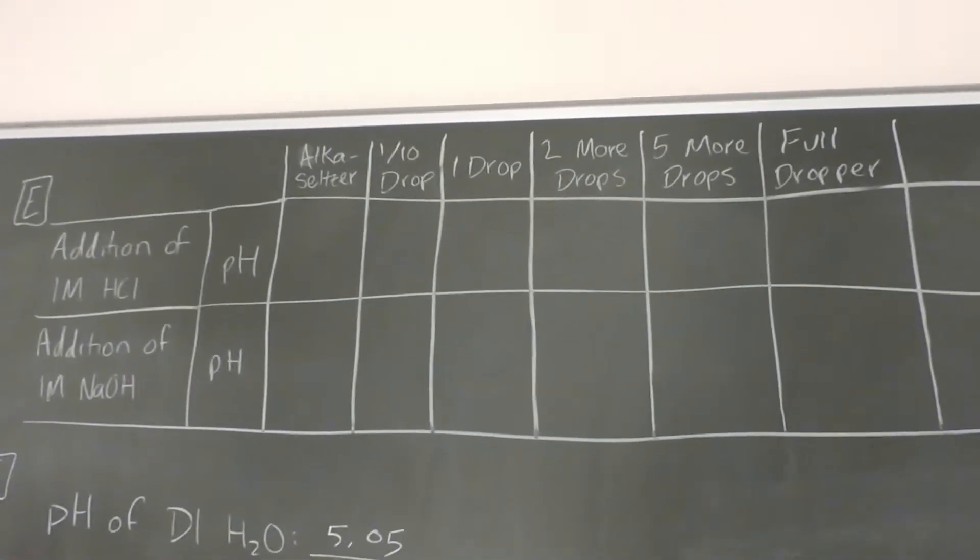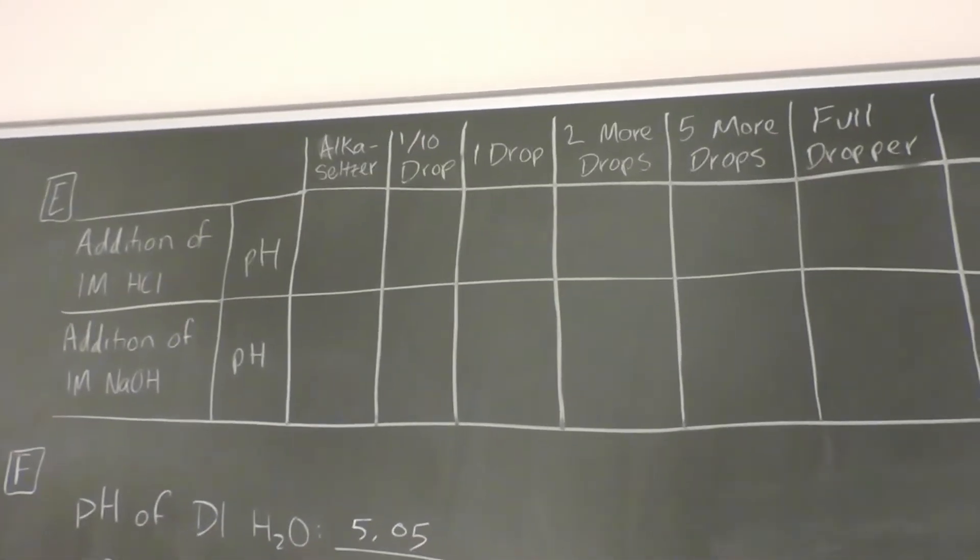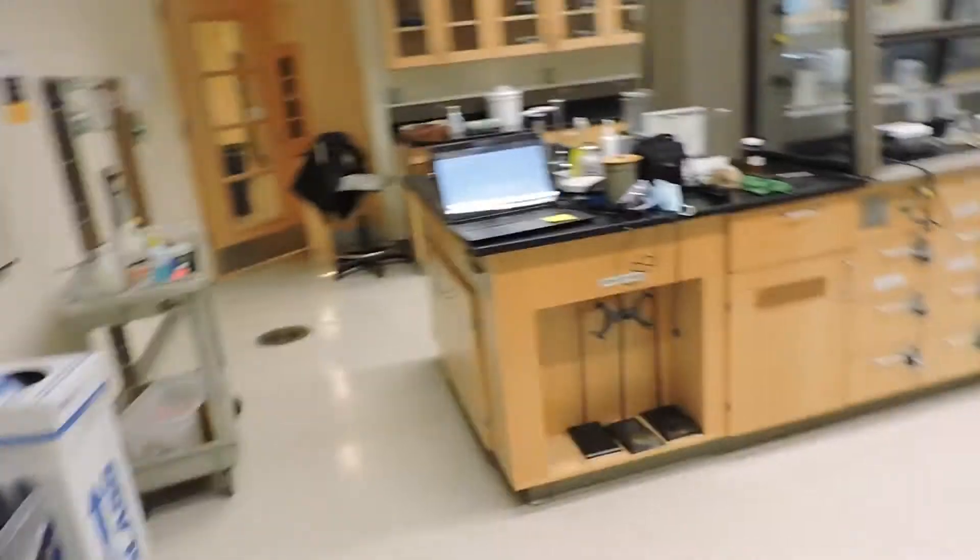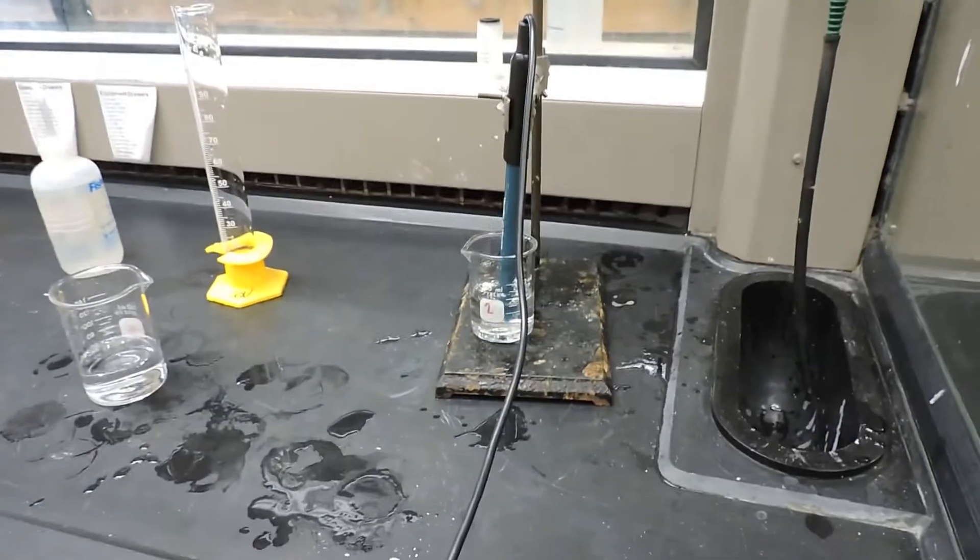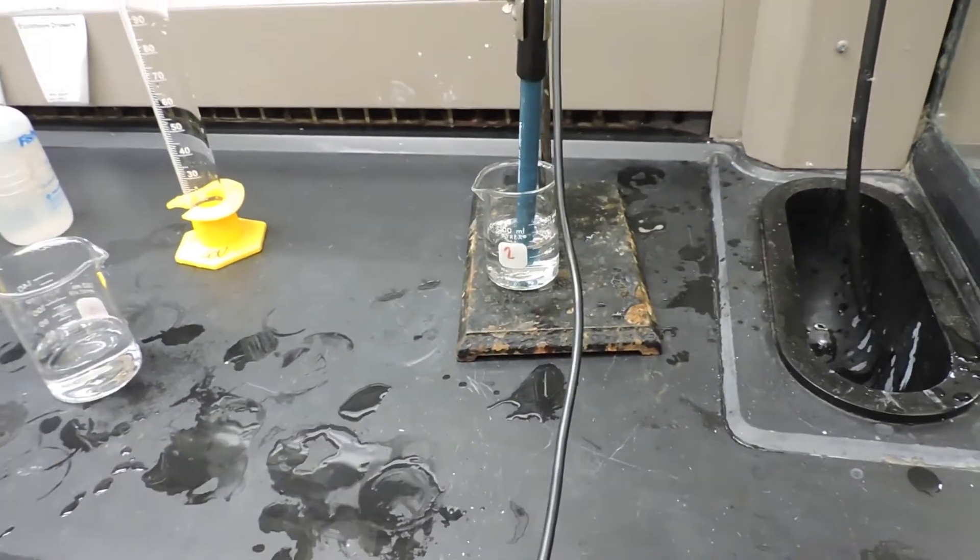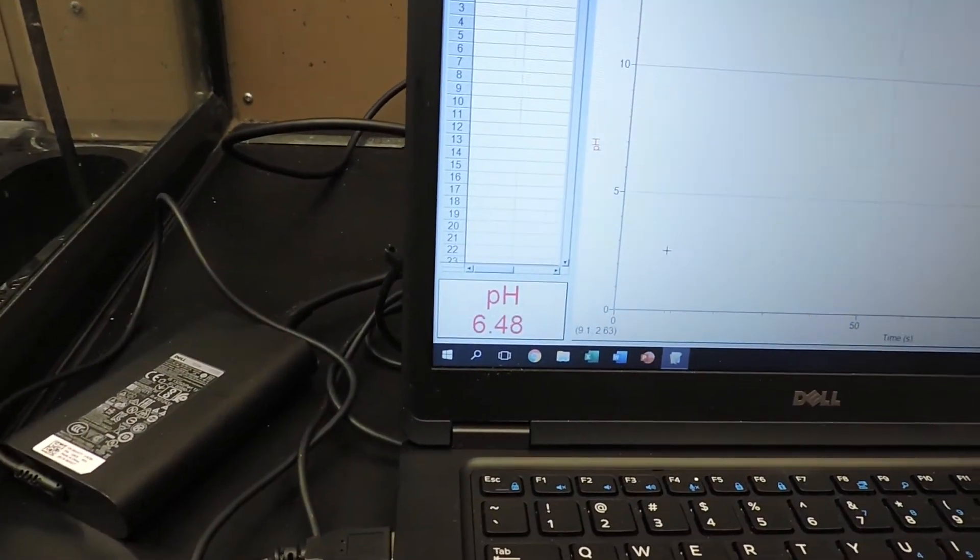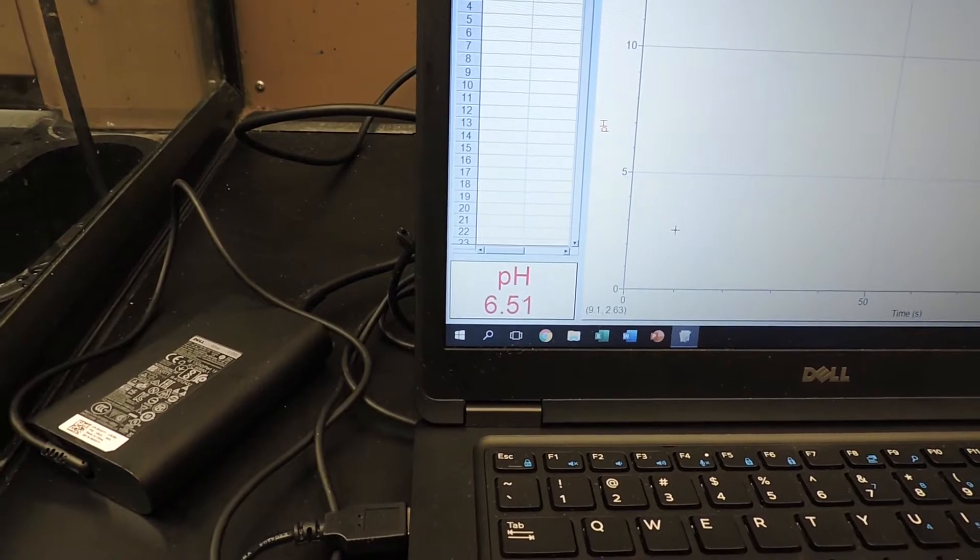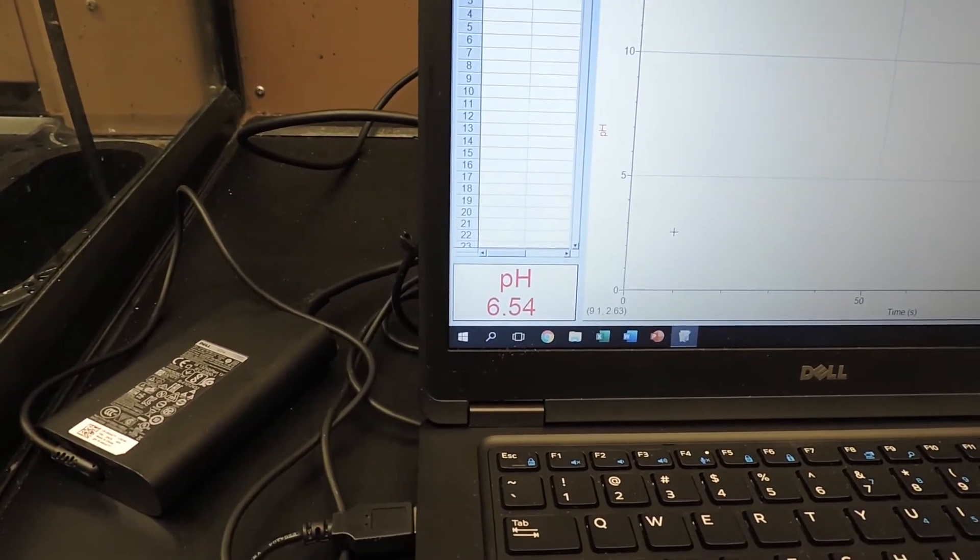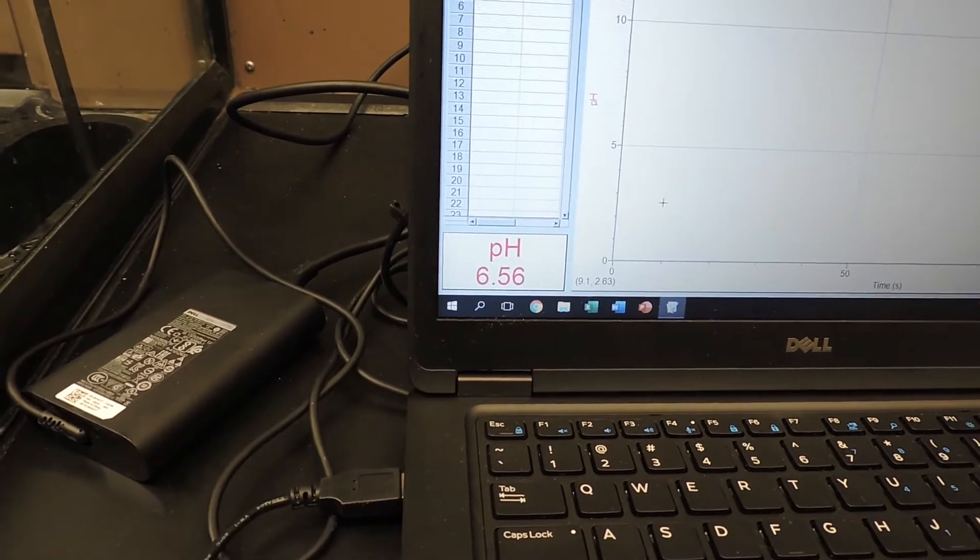Then we will repeat the same procedure that we have been doing where we add different amounts of acid and base and see how the pH is changing once we do that. Now we have transferred 50ml of the Alka-Seltzer solution to the beaker and the pH of this is 6.56.